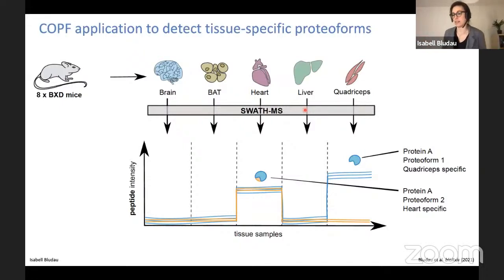And then I would say that the complex-centric analysis workflow doesn't necessarily work very well. The other thing is that you need quite some material from the experimental side to perform a full-blown SEC-SWATH-MS experiment. I think it works already fairly nicely, and we could do it with tissue samples, for example, as well. But overall, you need quite some amount. So it's still some way to go, for example, to get to clinical samples.